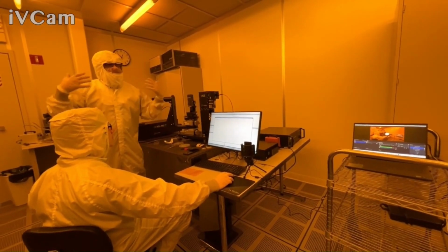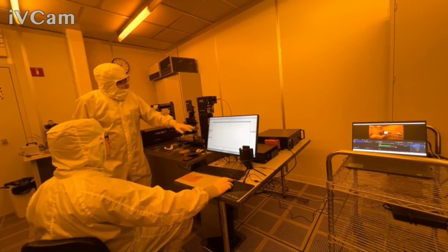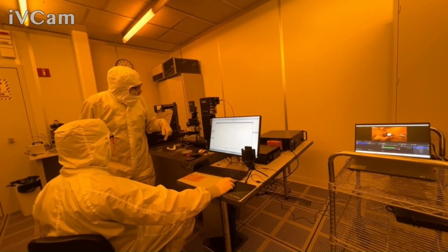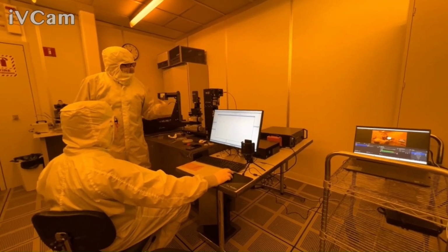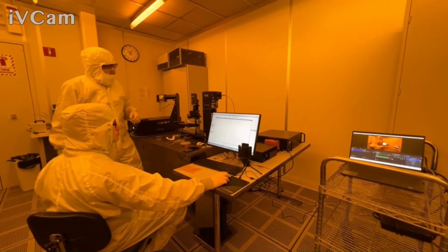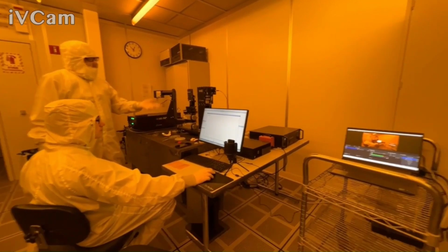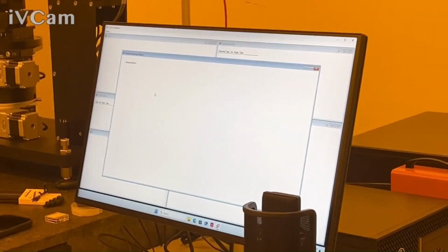So that's what I'm saying. If it got closed, you'll have to calibrate anyways. Because once we initialize, we'll need to do that. So yeah, I just hit the initialize at the top. During the initialization process, it's going to home different motors, home the monochromator, kind of figure out what some stuff is. And then once it's done, we'll wait for that procedure to be done, it's going to ask you to basically say initialize but not calibrated.